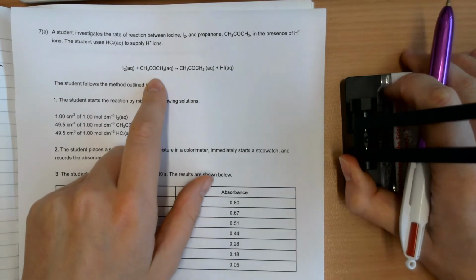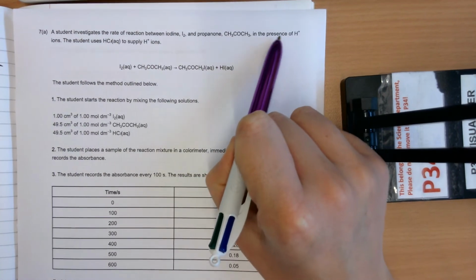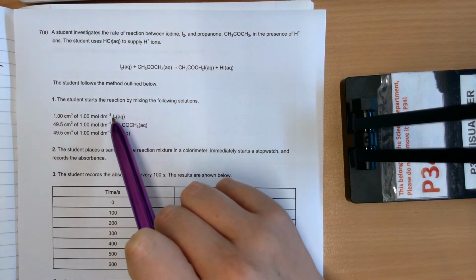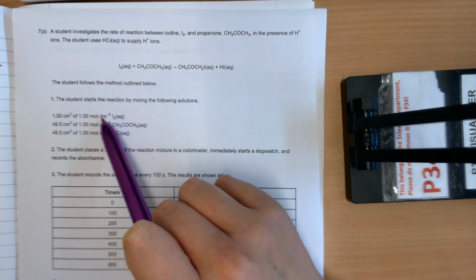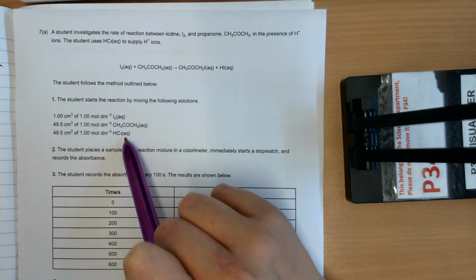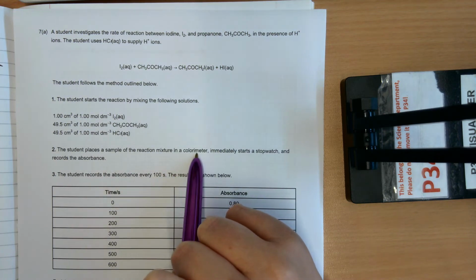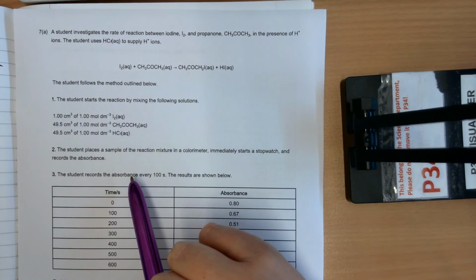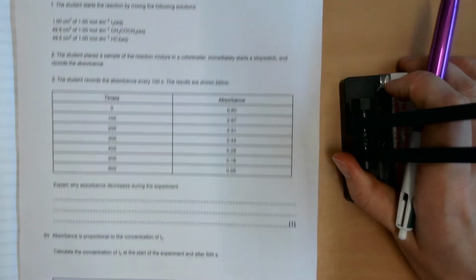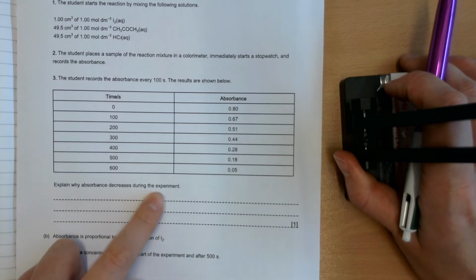So, the same reaction that we've just looked at. A student investigates the reaction between iodine and propanone in the presence of an acid, and this is the method they use. They start off with a known concentration of iodine. They know how much iodine they've got, and then they mix their iodine with their ketone and with their acid. Once they've got their reaction mixed up, they take a sample, put it in the colorimeter and start a stopwatch, and then they take different samples every 100 seconds and record the absorbance.